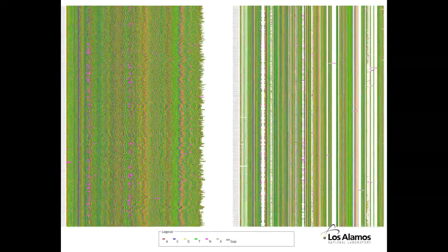I could make a choice to go in, and it'd be pretty simple to fix this alignment by hand to move those Ns over, or I could decide maybe I want to delete those sequences out of the data set before I align it, or I could change the Ns to real bases, maybe go back and look at the output of the sequencing run by eyeball and correct the Ns to the bases that are the best call for those sites.